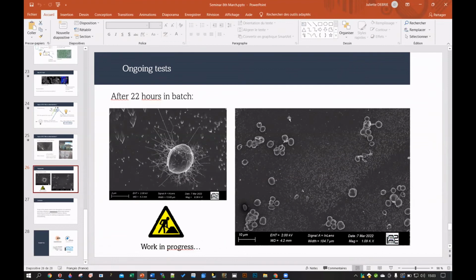In principle, these so-called cold oxygen plasma techniques will for sure remove all the organics because they will convert them to CO2, even the carbon coating and everything, this will be gone. And in principle, these techniques should not damage the surface.